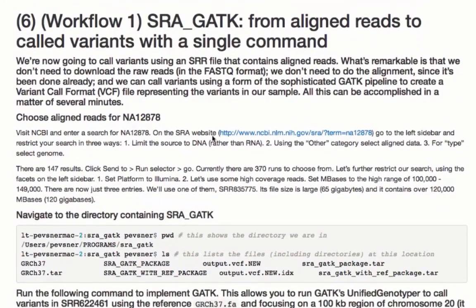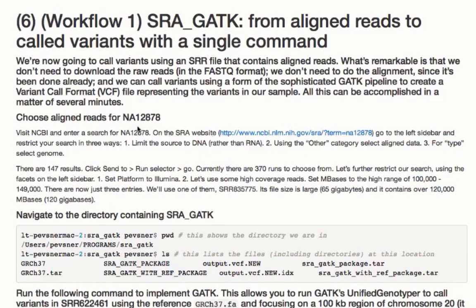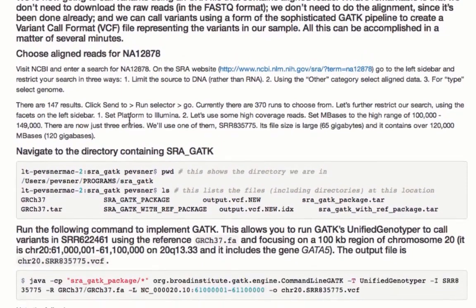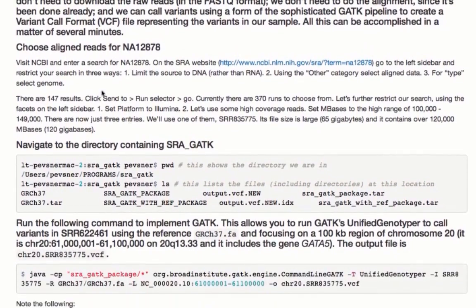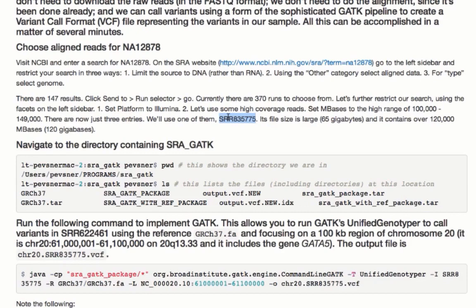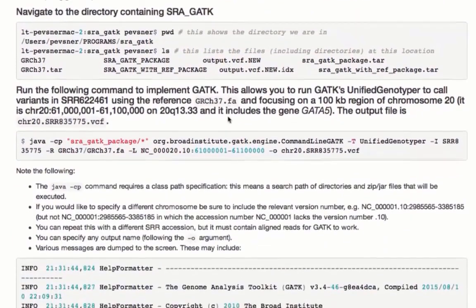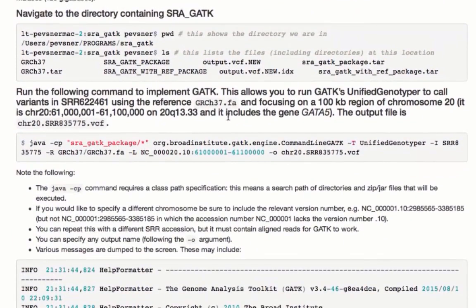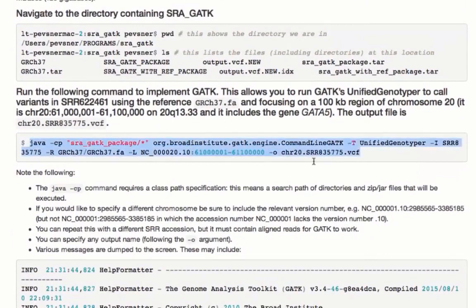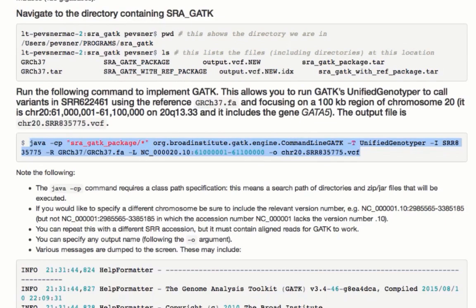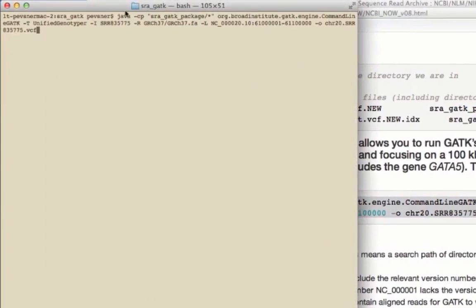We'll end this session by calling variants, and we'll do it with SRAGATK. This is really fast and easy. And here we are. We choose our aligned reads for NA12878. We can do that right from the NCBI website. And in our case, we can go ahead and use SRR 835775. This is a nice sized file. We don't have to download it. All we have to do is point to it. Navigate to your directory that contains SRAGATK. And then run the following command. I'll copy it right now. You can do this too off of the HTML, if you would like. And we're going to look at a region of chromosome 20, which includes a particular gene, GATA5. And we'll go ahead and start running the command. This is a Java command, dash CP. And it calls an SRAGATK package. It points to the Broad Institute. And I'll start by hitting enter.